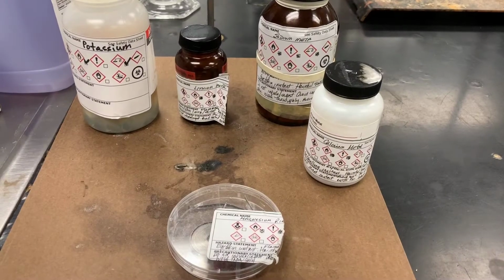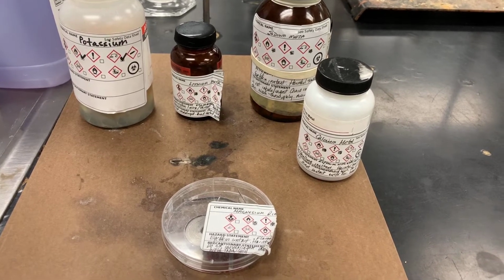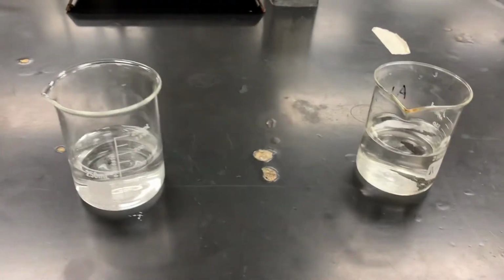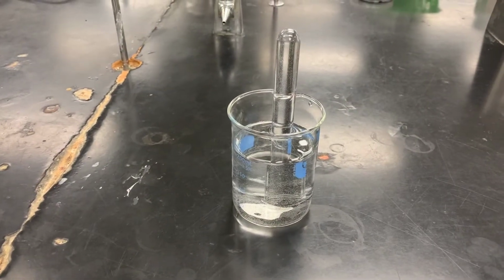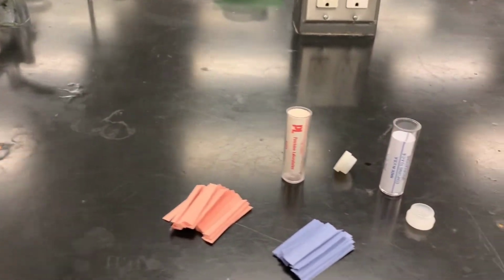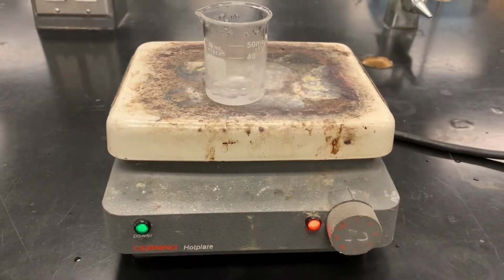In this lab, we're going to need some potassium, lithium, sodium, calcium, and magnesium metal. We've got 3 beakers, 1 beaker with an inverted test tube, some litmus paper, and a beaker with some boiling water.